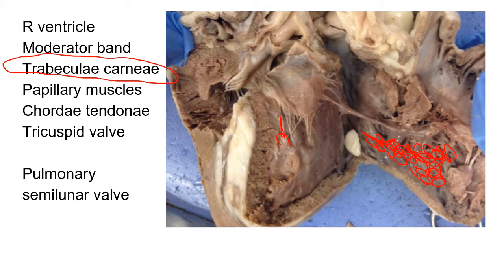Now we can kind of see that there's a little bit of atrium up here with pectinate muscles. And the last thing we can kind of see is if you follow this chamber, this ventricle, the blood would go up here and out a blood vessel. So this blood vessel I'm going to bracket, that's the pulmonary trunk. And these little flaps of tissue I'm coloring on, it's here, it's on that back wall, it would be on the side wall but we'll cut through it. That would be the pulmonary semilunar valve.